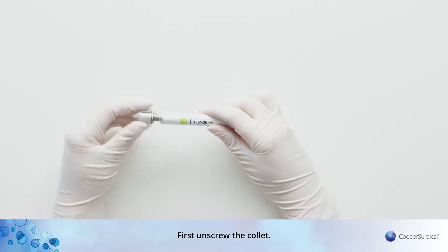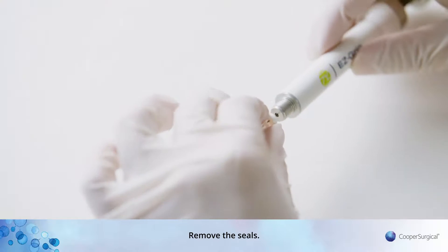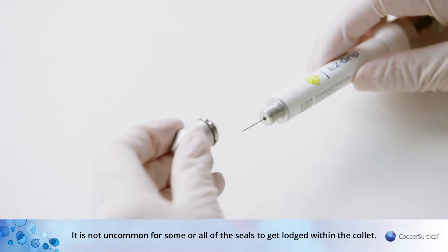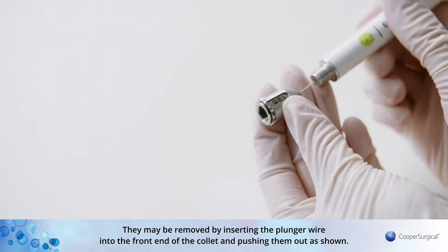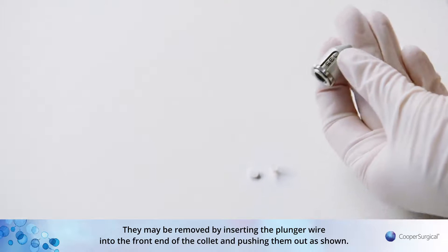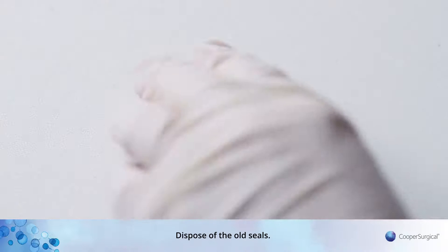First, unscrew the collet and remove the seals. It is not uncommon for some or all of the seals to get lodged within the collet. They may be removed by inserting the plunger wire into the front end of the collet and pushing them out as shown. Dispose of the old seals.